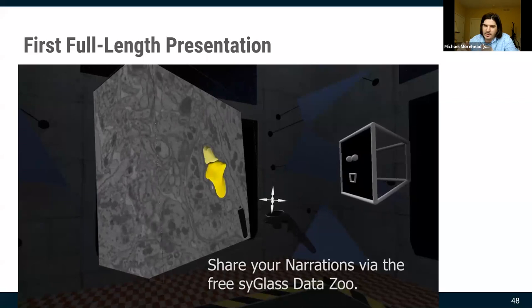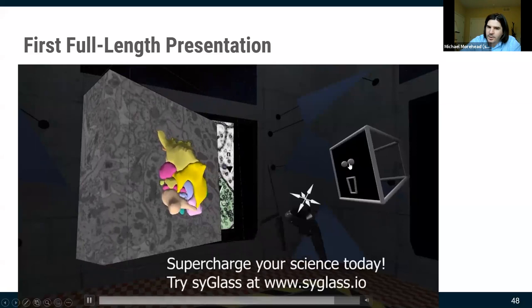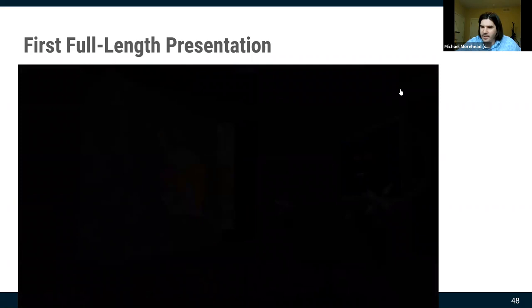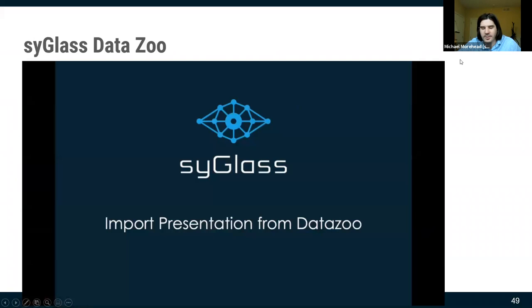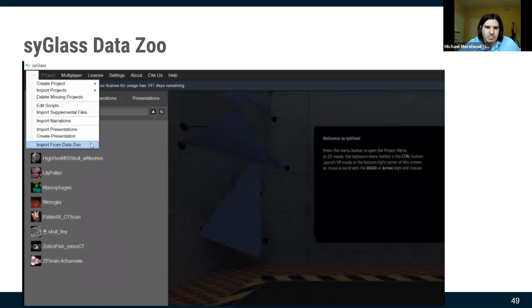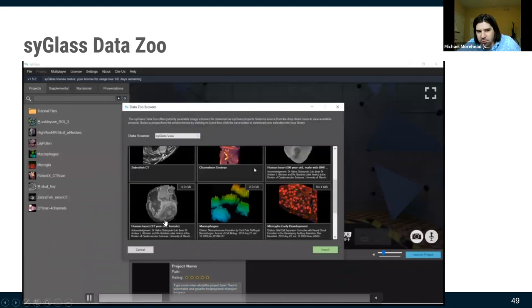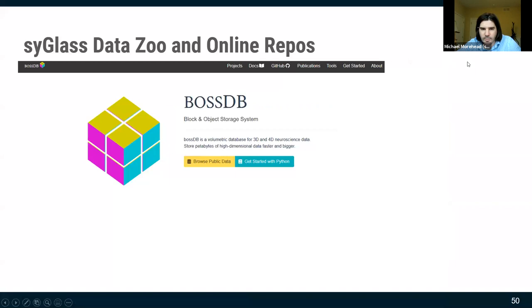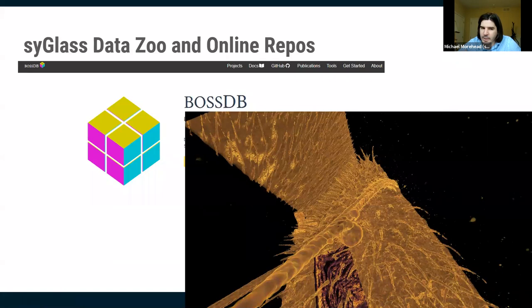You hand someone a narration, they press play, a little avatar comes out and does everything you did and says everything you said. We've also added 2D slides on the walls. Lecturers can make these narrations and share them indefinitely. I've already discussed the Data Zoo for sharing datasets and presentations. We're also working with NIH and Janelia to hook up to their very large databases.